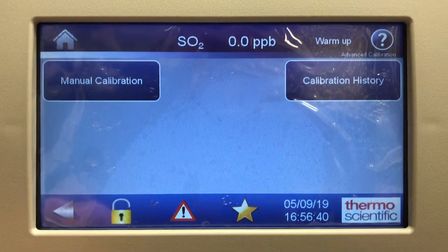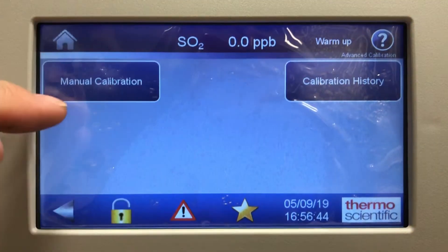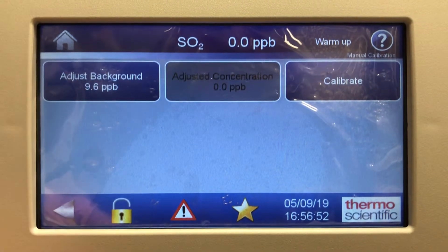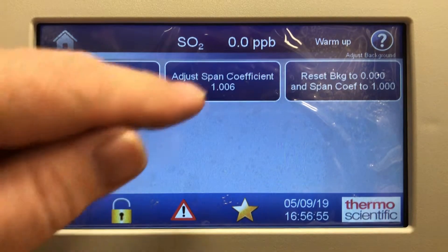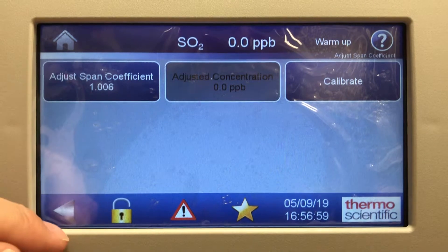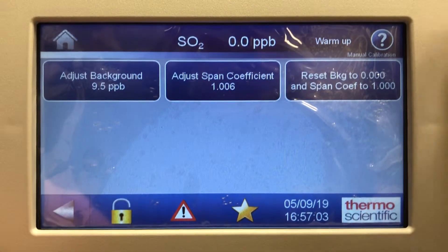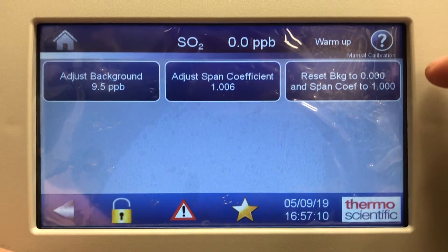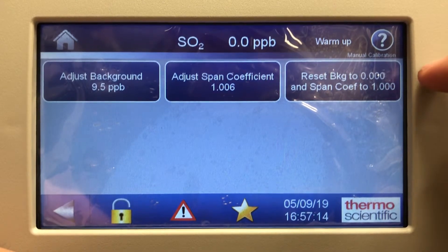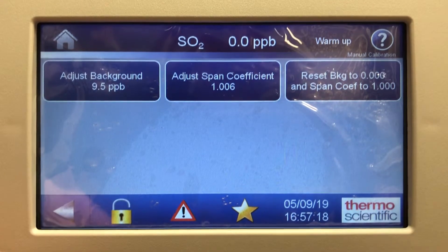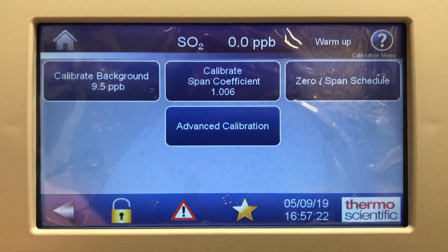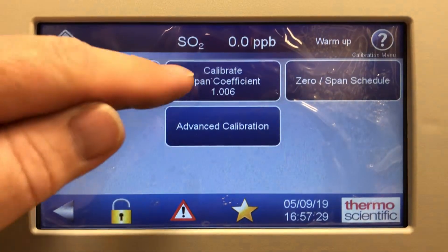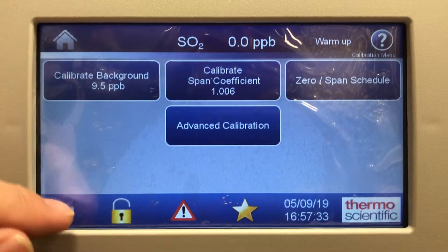Advanced calibration has a manual calibration option and calibration history. In manual cal, we can manually adjust the background and span coefficient. There's also a screen where you can reset the background to zero and span coefficient to 1.00 — just like on the i-series — and start the calibration all over again from there. That covers everything in the calibration screen: background, span coefficient, zero span schedule, and advanced calibration. Pretty straightforward how to calibrate the unit.